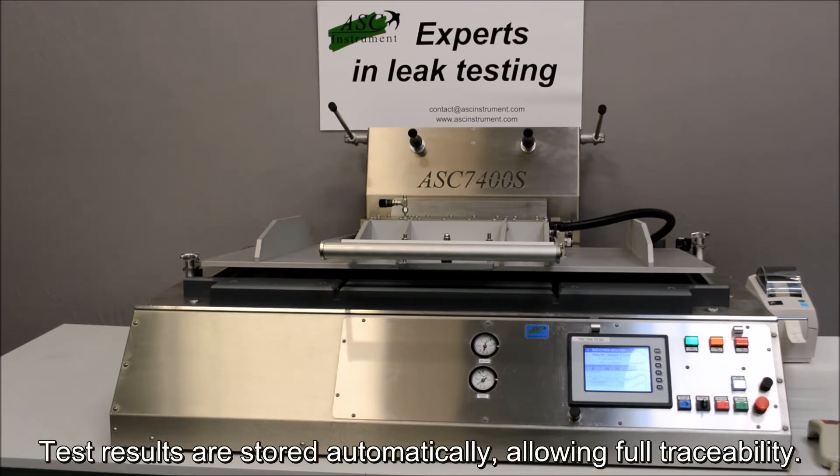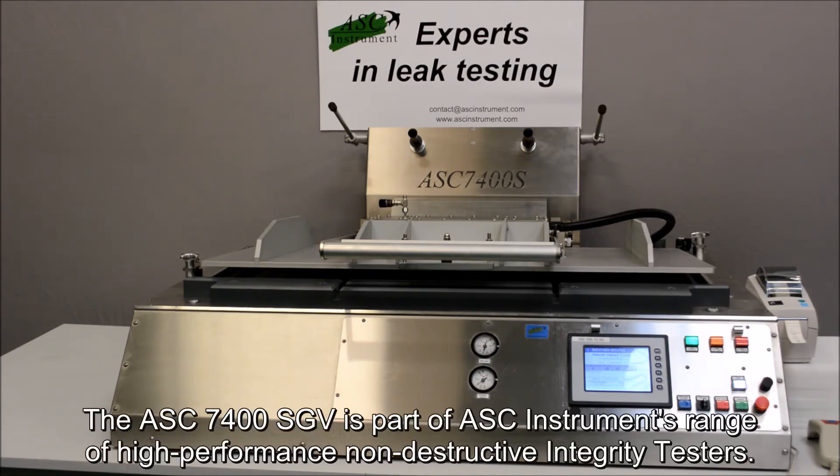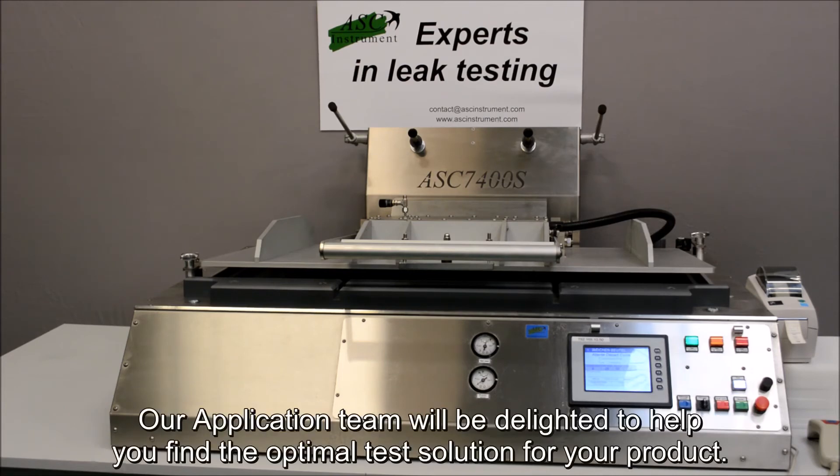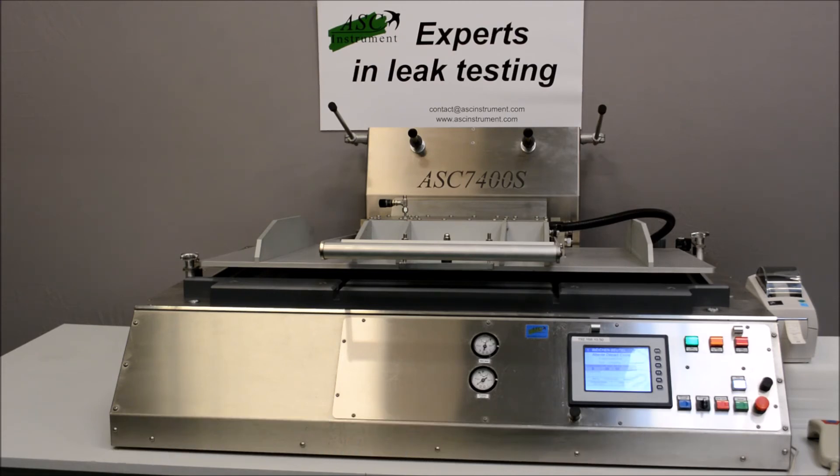Test results are stored automatically, allowing full traceability. The ASC 7400SGV is part of ASC Instruments' range of high-performance non-destructive integrity testers. Our application team will be delighted to help you find the optimal test solution for your product.